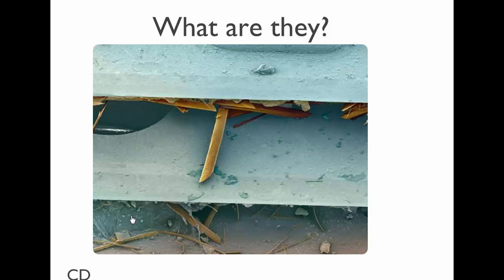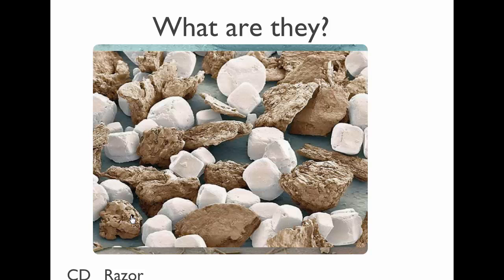These are razor blades. What is this? Hairs. I don't understand. What's the black thing then? That's like a hole in the razor blade. So you can see the sharp angle of the blade. You can see the hairs that got cut off by the razor. That looks like concrete. Yeah, it does. It's not s'mores cereal.